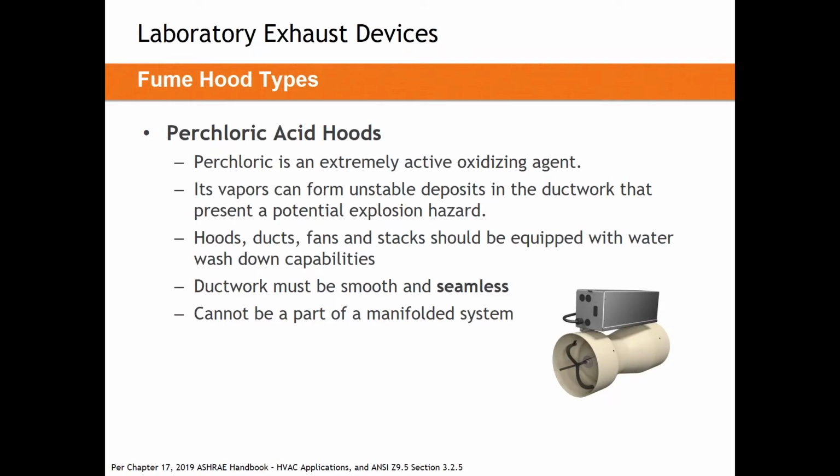So while the valve could technically work in this operation, we cannot apply a VAV or constant volume Venturi valve or high accuracy terminal. We cannot apply those in a perchloric acid system. These are essentially constant volume systems that go directly from the perchloric hood to a fan. Those fans will be designed with a bypass, so that perchloric is never actually introduced to the fan system and never has a place for that perchlorate to form where it can't be washed down with water.